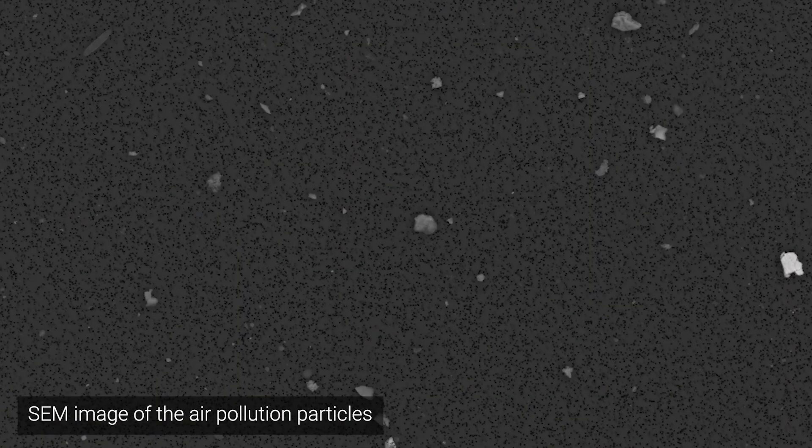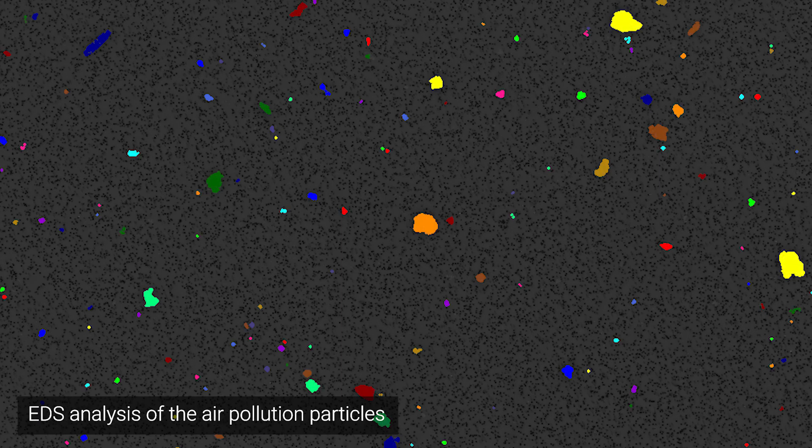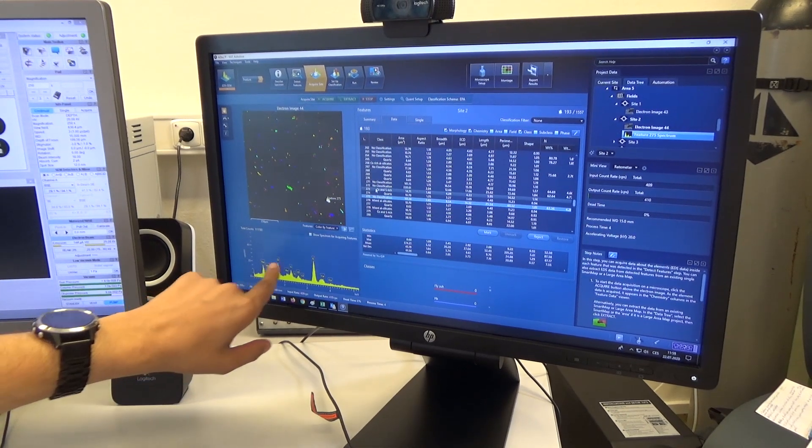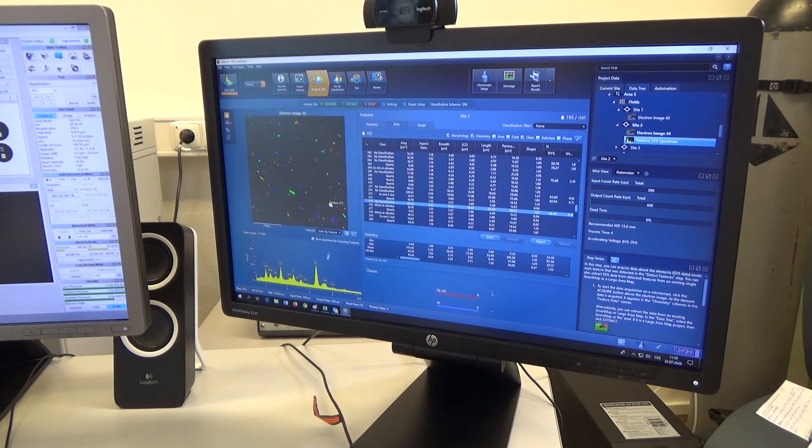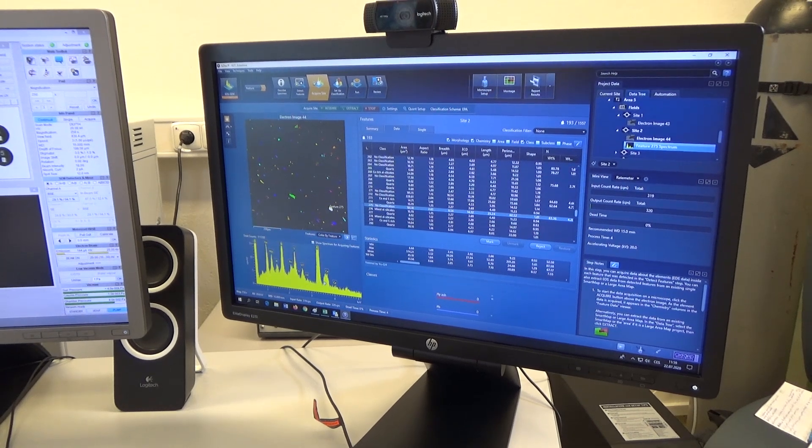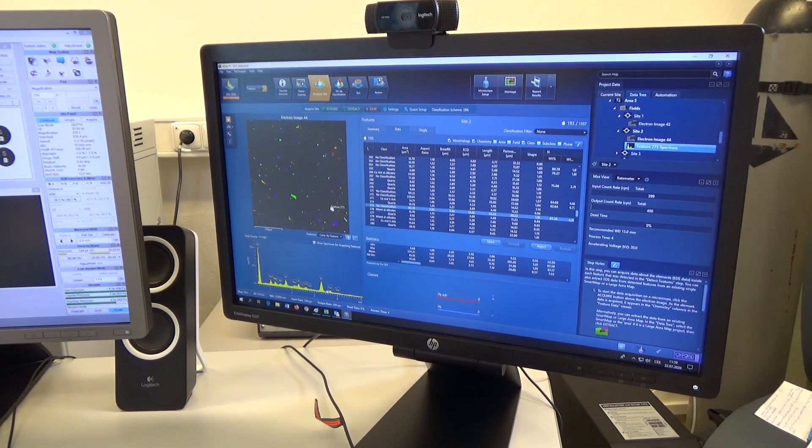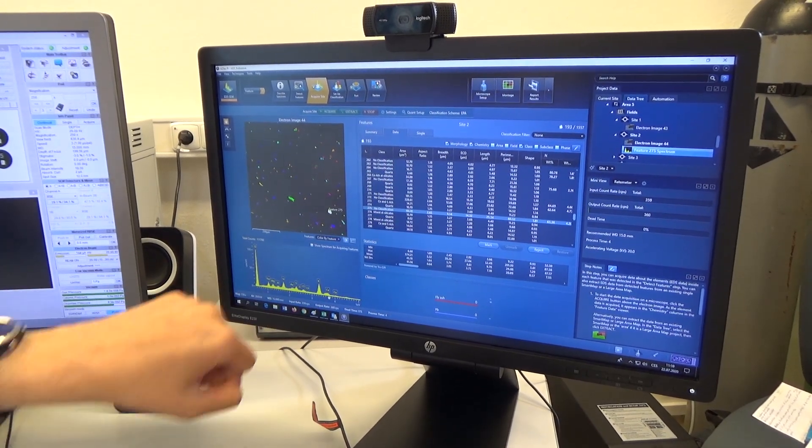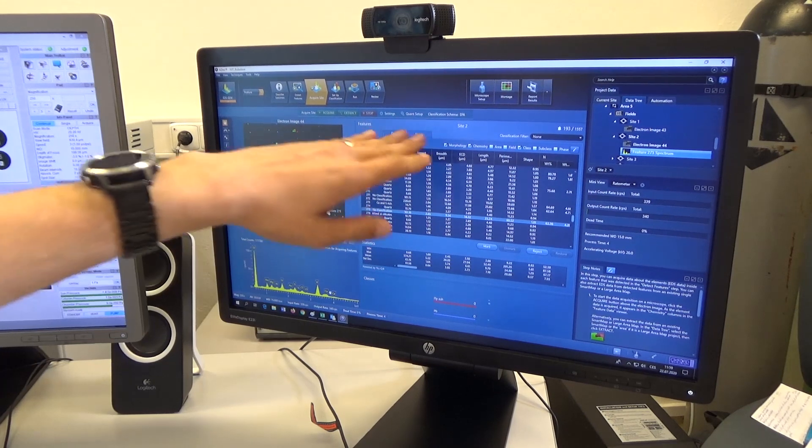We try to analyze at least 2000 particles per filter. The result is a spectrum produced for each particle, where we can see individual peaks, and each peak represents a certain element.